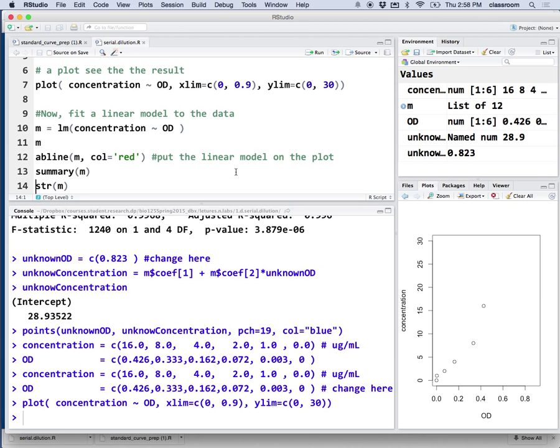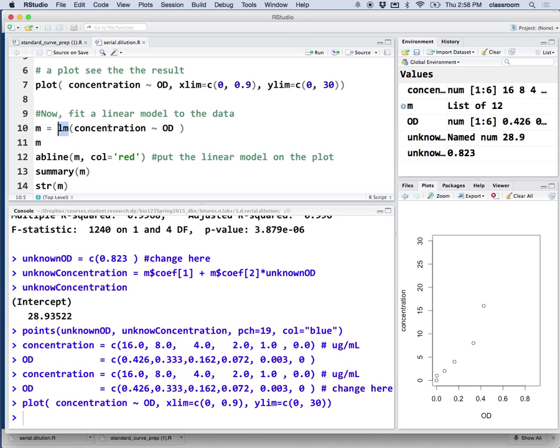I think about this is the first experiment, so that's pretty good linear anyway. Alright, so we're going to fit the line through the studs. So I'm going to use a command called lm, which is a linear model. I'm going to fit, again, Y over X, concentration is Y, OD is X.